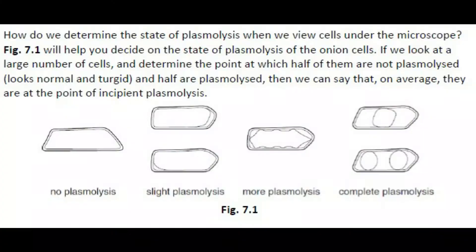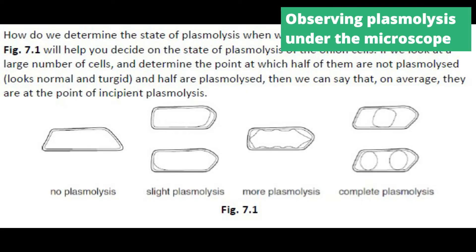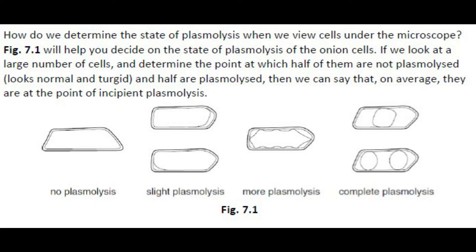After this, I actually waited for two to three minutes before observing under the microscope. Under the microscope, this is what we should observe. This is a cell that is not plasmolyzed at all — the cell membrane and cell wall are adhered together. With slight plasmolysis, the cell membrane tends to pull away from the cell wall. With more plasmolysis it pulls away even more, and with complete plasmolysis it looks like a little circle, because in plasmolysis water diffuses out of the cell, leaving very little water inside and causing the contents to shrink.